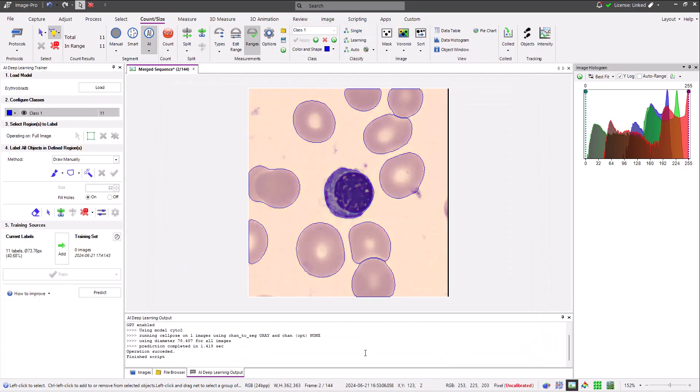The deep learning trainer is divided into five sections. Section one is used to load the model that you wish to train. As my erythroblast model is already loaded, I won't need this section.